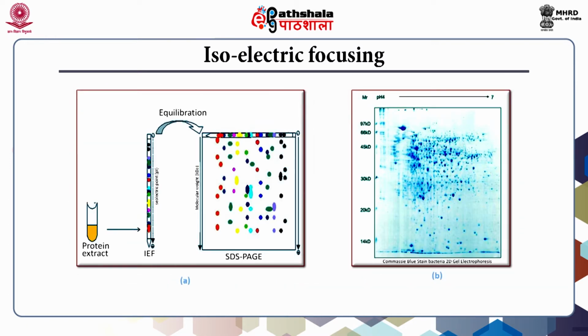Two-dimensional electrophoresis is an advanced method of protein separation where the separation of the proteins on a gel is conducted in 2 dimensions. It involves the combination of isoelectric focusing with SDS-PAGE to obtain protein separation with a very high resolution. The sample to be purified is first subjected to isoelectric focusing as described in the previous section. For the second dimension, the gel is then subjected to SDS-PAGE electrophoresis.